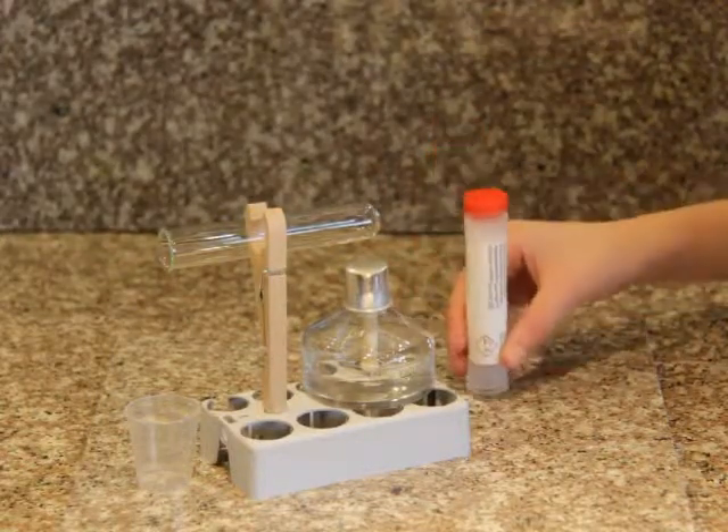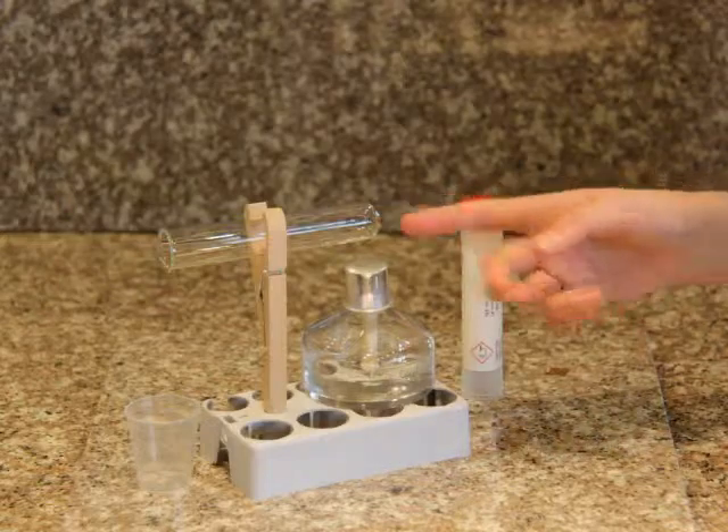Next, measure two spoonfuls of sodium hydrogen sulfate into the test tube.